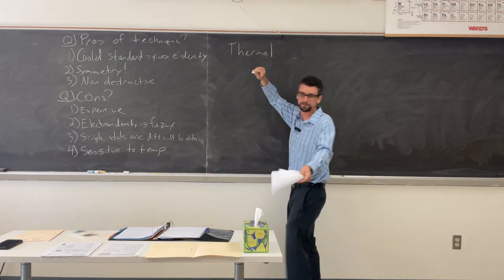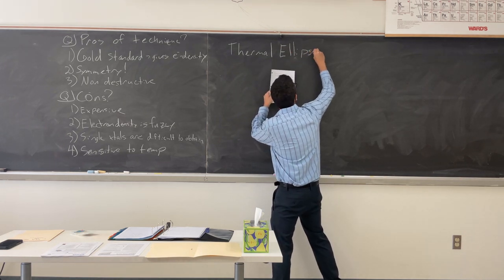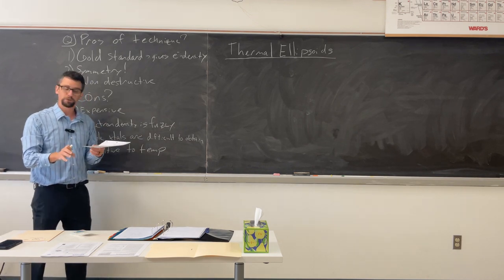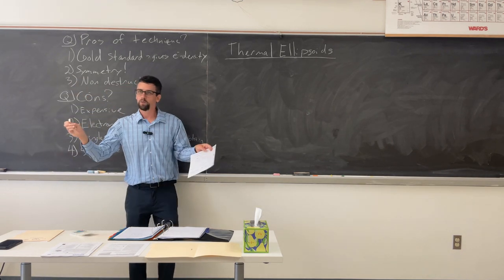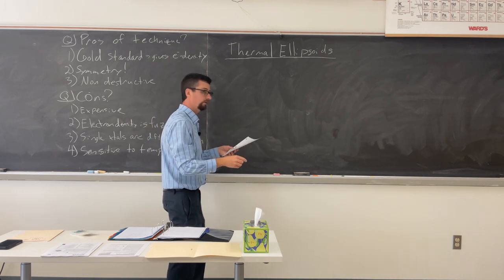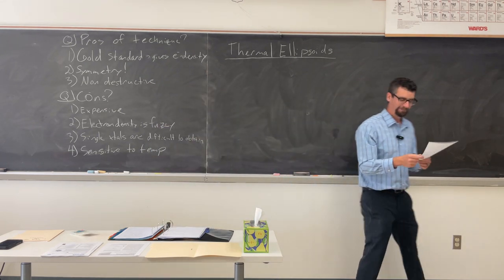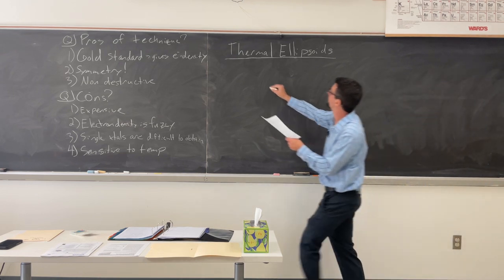Let's talk about those thermal ellipsoids that you have. They're also often called atomic displacement parameters or anisotropic displacement parameters. When you hear the word isotropic, what shape should be in your head? Not a triangle. It is still iso something, isosceles. Sphere. Yep, 3D. So spherical distribution.